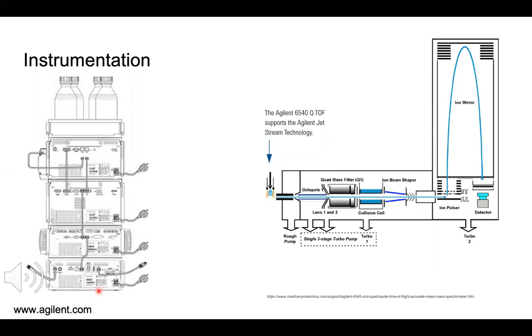the instruments that they used were HPLC mass spec instruments with triple quadrupole analyzers. However, since these do not allow for structural identification of non-target compounds, they went ahead and used time of flight analyzers as well in order to extract the fingerprints of the less abundant cannabinoids. The reason for this is that time of flight analyzers provide accurate mass identification for both the precursor and the product ions. So this allows us to differentiate between compounds that have the same overall mass, but different elemental composition.